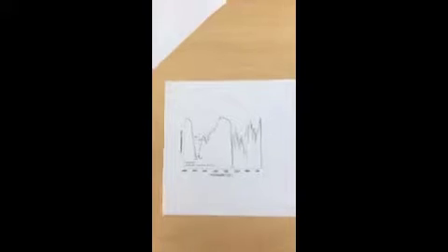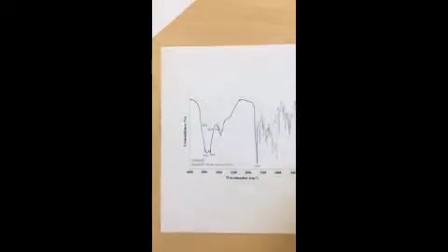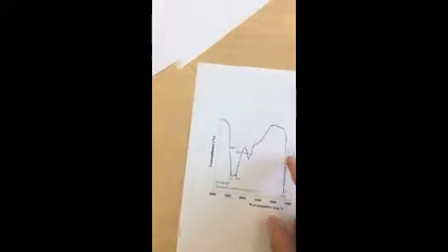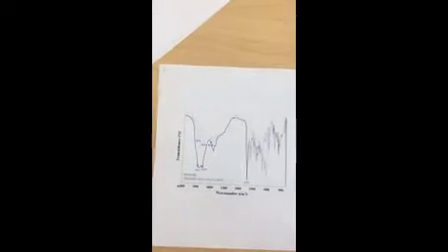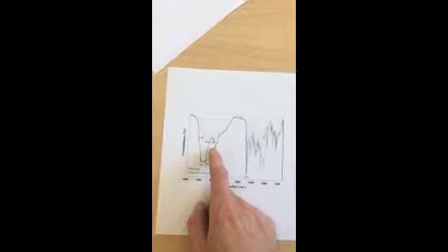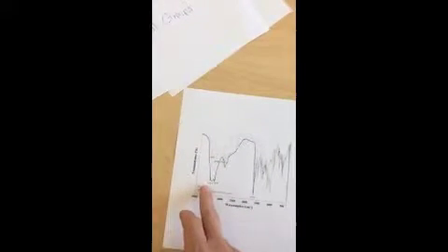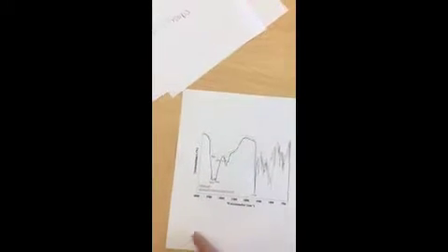Now let's talk a little bit about IR peak assignments. I have here an actual IR reading from sildenafil. It's highlighted in blue as sildenafil. Notice how we have a large peak here, about 1700. A smaller, but it's still a medium peak here, about 3000, and a larger but medium peak at 3400. Now let's look into what makes these peaks.